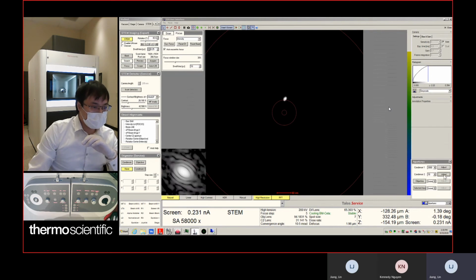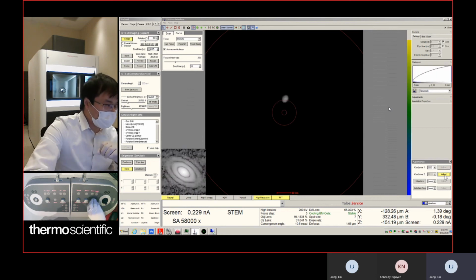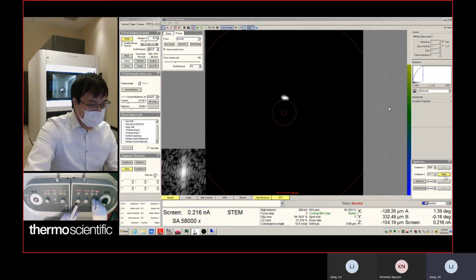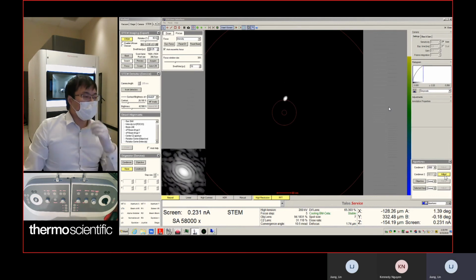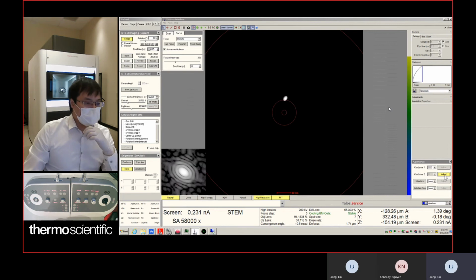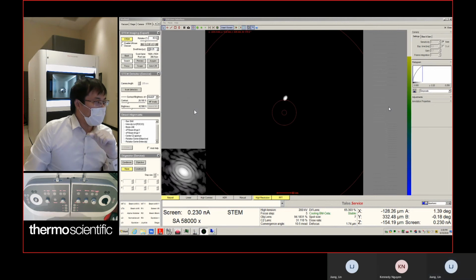You can say adjust, and then you can go on the focus and take a look at the beam. If your beam is not wobbling concentrically, you can use multifunction X and Y to adjust the C2 centering. This is very important. The note: if you want to adjust C2 centering, it's better to change focus to intensity. Don't use focus as objective. Okay.